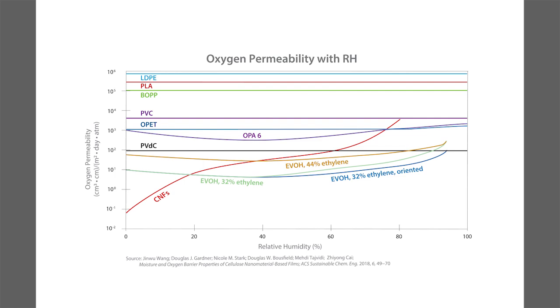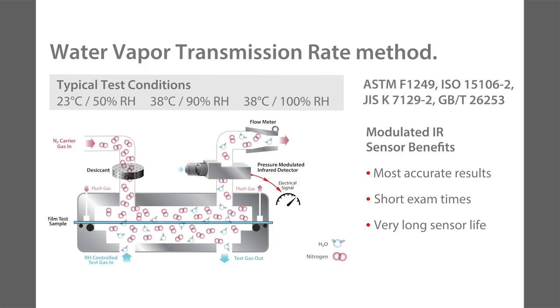So that's good. This next piece I wanted to talk about is the method itself. How do we test for this thing called permeation? The way we do it is like the original schematic I showed you, where we had a barrier film, and we had a test gas challenging on one side, and we had a carrier gas or a different gas on the other.